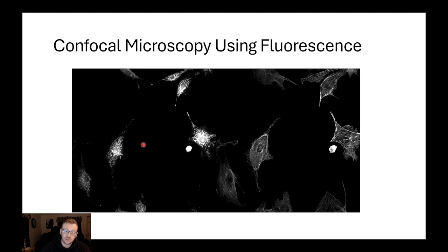And then those filter sets I was talking about, where the dichroic is bouncing certain wavelengths of light. Our fluorophore doesn't exist outside of the cell because these are really well prepared cells. And so we have no background noise now because we've filtered all the ambient light out and we're specific to a single wavelength of light inside of the cell. So you can start to get really detailed images of cellular processes by using confocal in conjunction with the fluorophore. Most modern microscope images that you're going to see are going to be fluorescent molecules in confocal modalities.